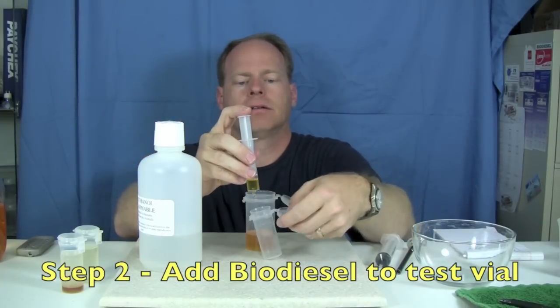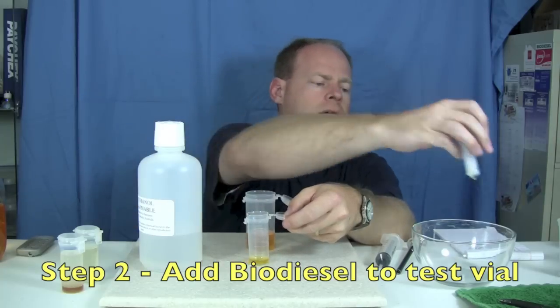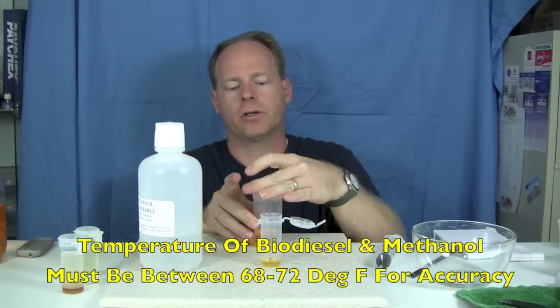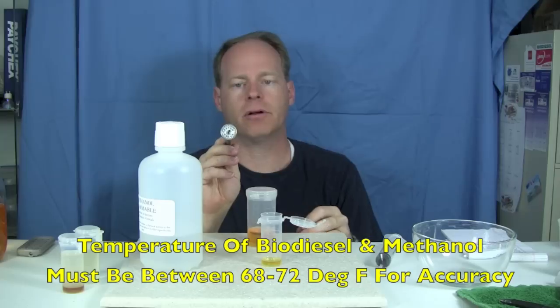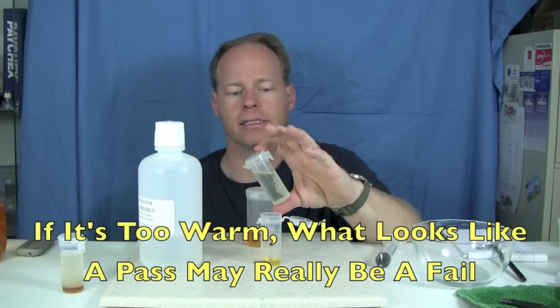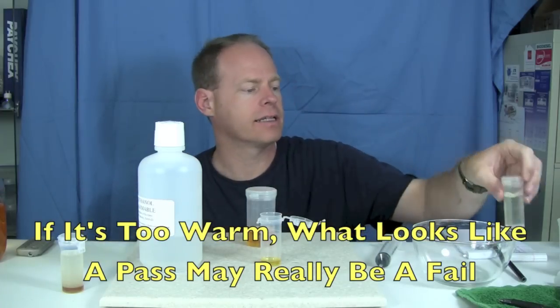Then we're going to measure out 27 milliliters of methanol. I have a temperature controlled room — I've pre-measured the temperature of this biodiesel using this thermometer and it's about 71 and a half degrees, so we're right on that limit. If you're warmer than 72 degrees Fahrenheit, it's possible that unreacted biodiesel can dissolve into methanol and it'll make the test look like it passed when in fact it didn't.